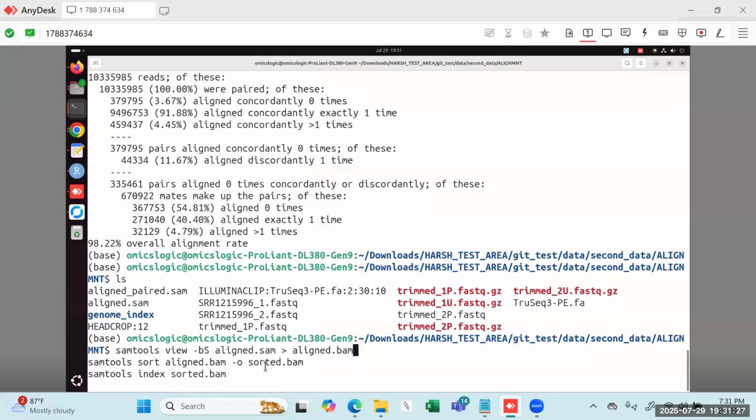It is going to give us the .bai file so that we can quickly load specific regions if we want to visualize them on IGV. So these BAI files help us improve visualization, and also help us look at efficient features, like if we want to look at some genomes and exomes. So this indexed file will help us do that.